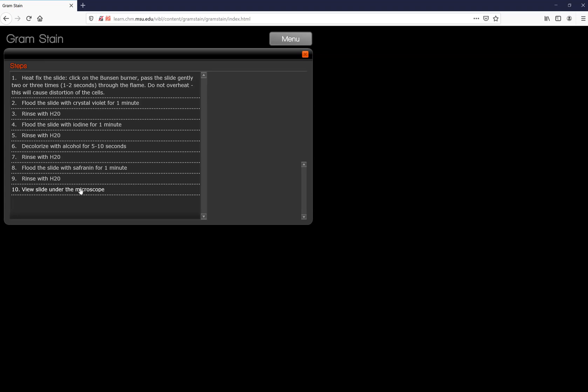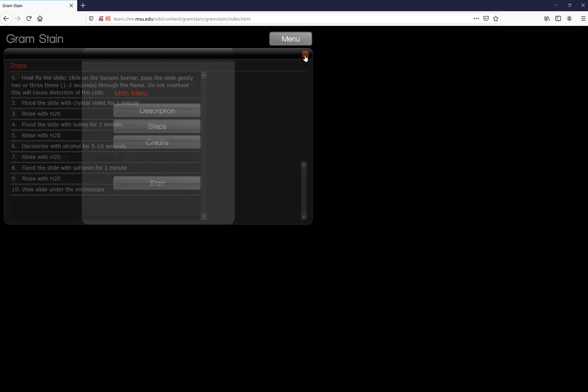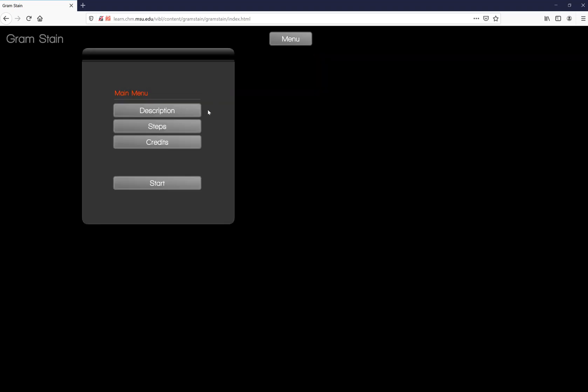When you're done and you can view your slide under the microscope, you should see definite purple versus blue or pink versus blue. If you see green or brown then you did something wrong, so let's go ahead and take you through it and try this out.